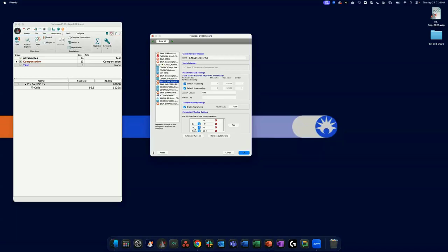This is the recommendation for dealing with S8 or A8 data in FlowJo 10. You can create a rule to hide -H parameters, hide -W, hide -T. You can do this by adding a rule. Here, I'll go ahead and delete these so I can show you.